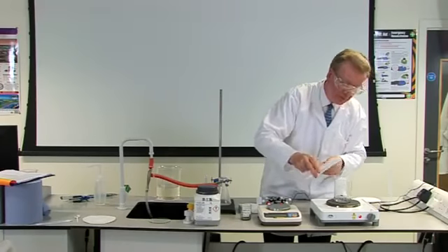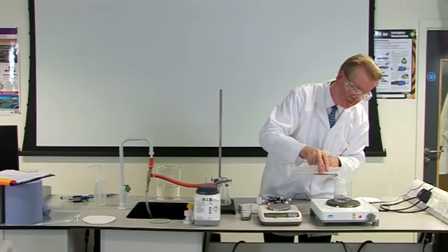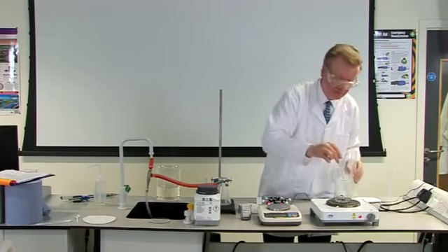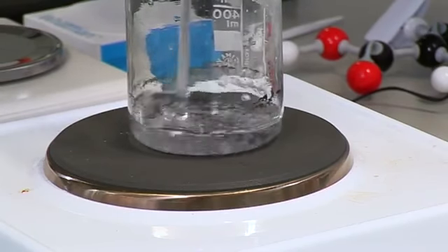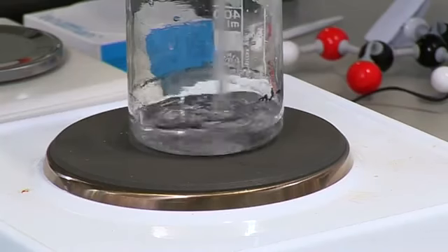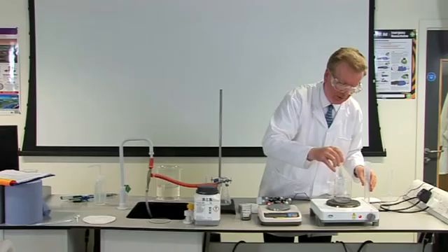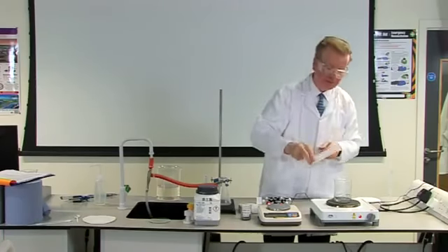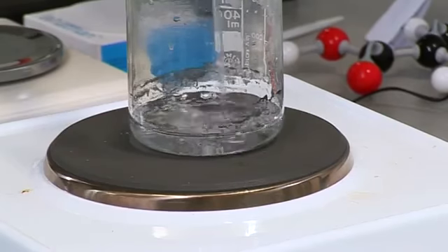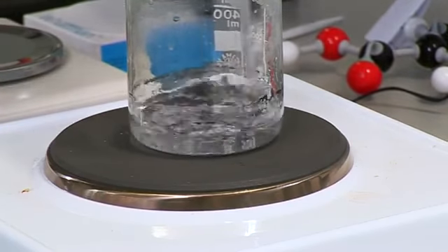Continue to add 10 cm³ portions of water to the boiling water in the beaker until the benzoic acid has dissolved. That is, until you can no longer see any of the white solid. Only the specks of impurity, for example charcoal, will be visible in the water. While heating the water, keep the solution well stirred with the aid of a stirring rod.